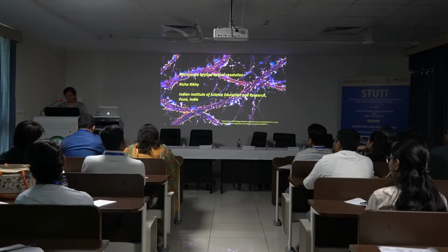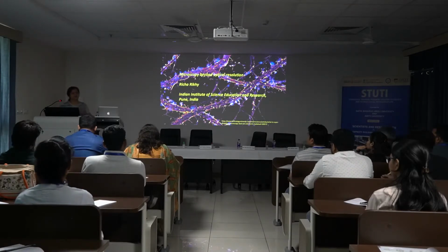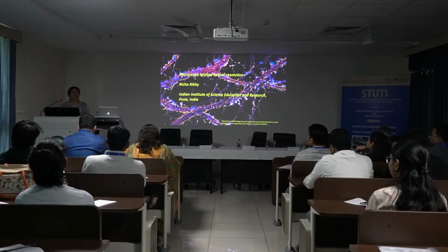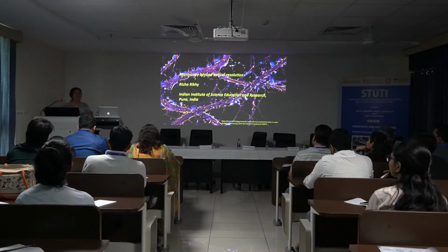Okay, so what I'm going to do is combine talking about super resolution and also live imaging. Live imaging is something, like Richa said, which we do a lot in the lab, and we have specialized in not only imaging in vivo sort of large samples.